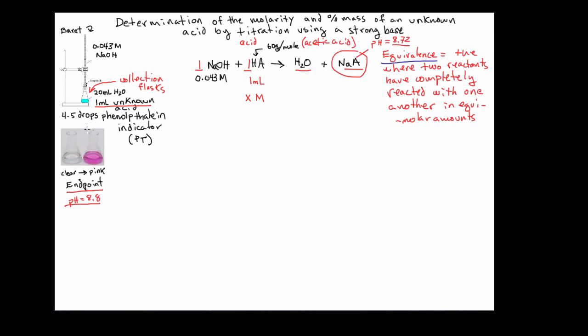All right. Remember, the main thing to see here, in terms of the purpose of this video, is to understand that when we generate the pink color, that is where we know that the reaction is over, and the stopcock needs to be shut down, and then the volume dispensed measured. So moving on now, let's say that we go ahead and we titrate this.